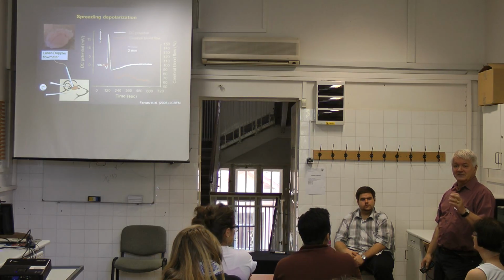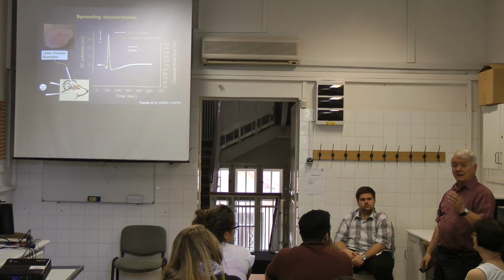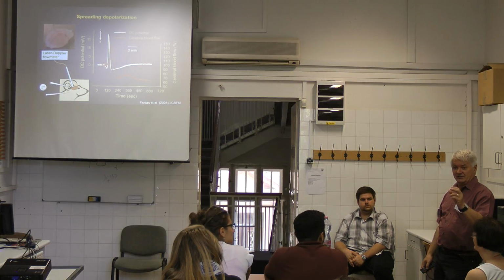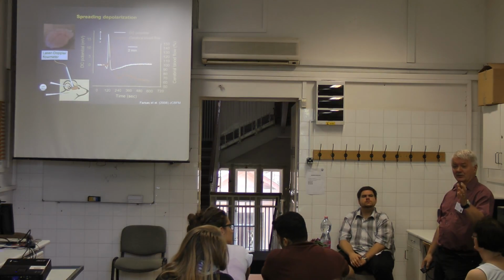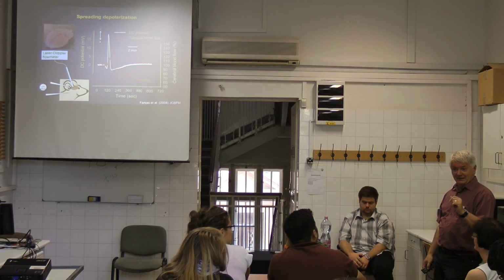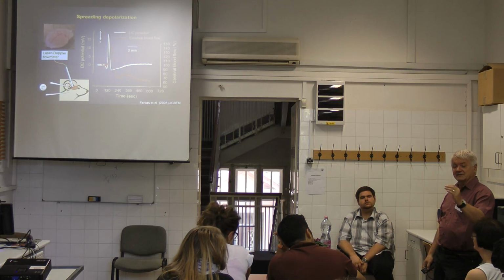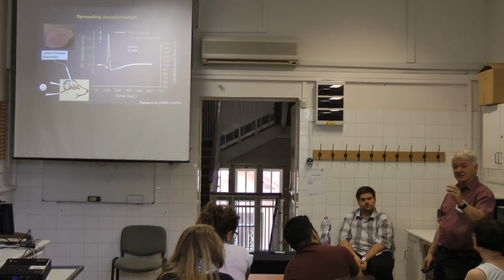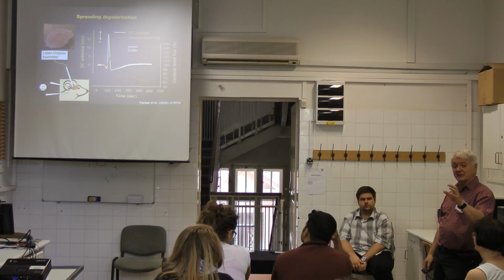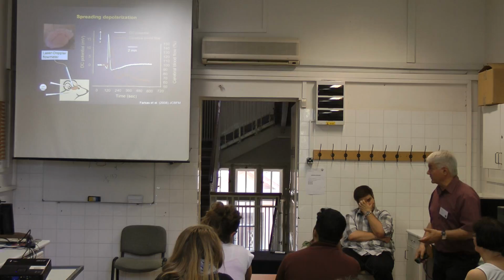What does voltage-sensitive dye mean? If the transmembrane potential is changing, they either absorb more or reflect more light. But the transmembrane potential in a living cell is about 60 to 70 millivolts. With a change in this range, the absorption or the reflection can also change, and therefore we can visualize electrical changes even on a big brain surface.